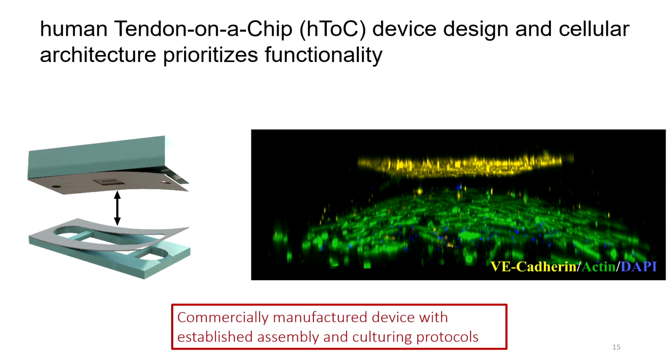And so we combine these top and bottom components reversibly. We connect the endothelium to our tissue construct, and this is done just through PSA adhesion between the two components. This is great because it allows for reversible binding. So at any point in the experiment, if you only want to study a single section of the device, you can take it apart, play with it, put it back together, whatever it is that you need to do.